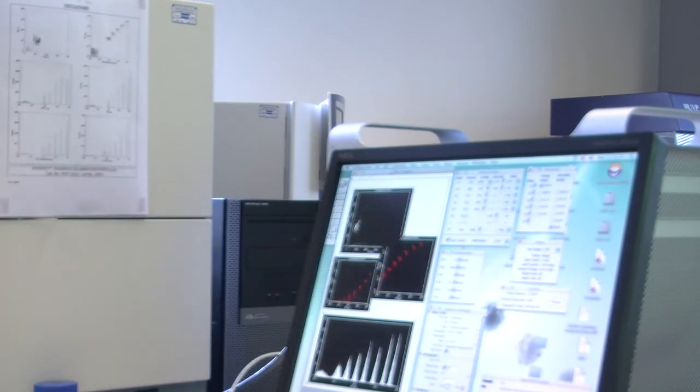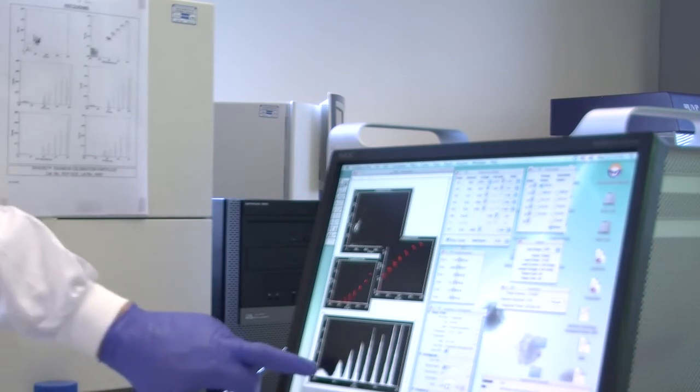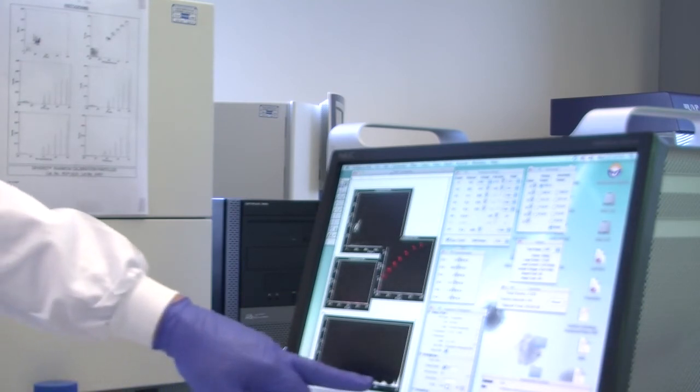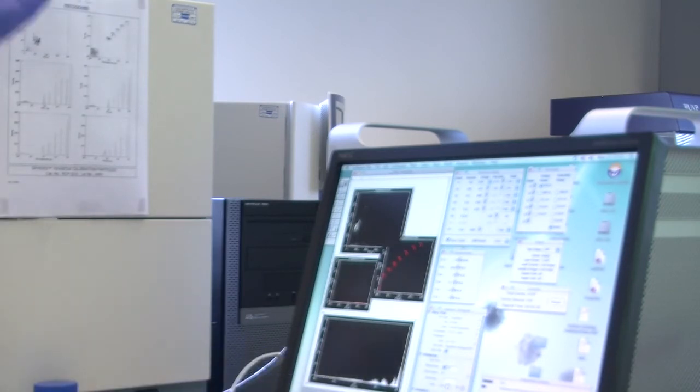But what it does show is our results are not absolute. So when we put our cells through, we cannot say they are fluorescent or they are not. You can't do that with a flow cytometer. Because you see this peak here, well, if I turned my detector up to 999 and restarted, that bottom peak is now probably here somewhere, or it might be here. Because I've just turned everything up, I've moved everything right along, so most of it's off the left-hand side.